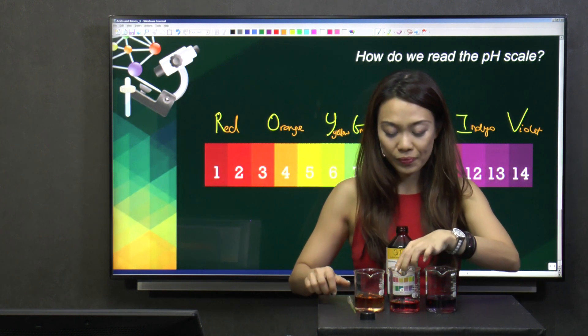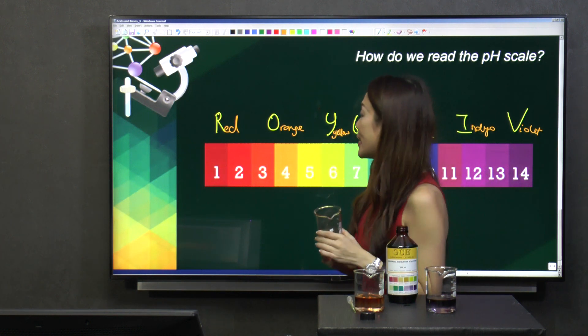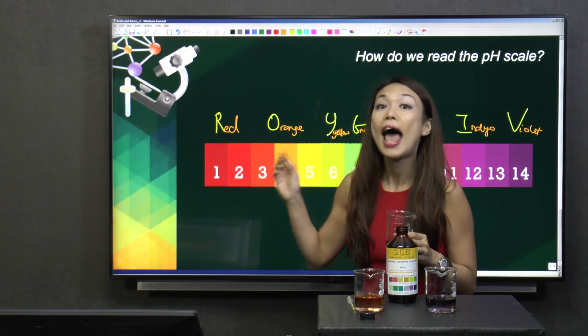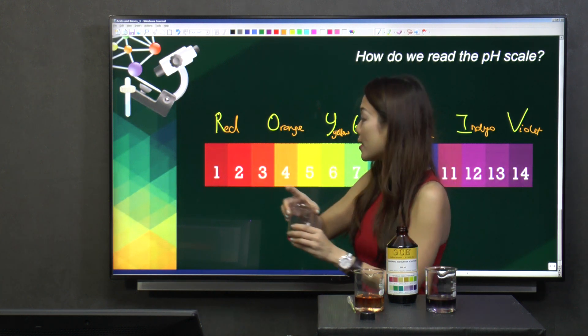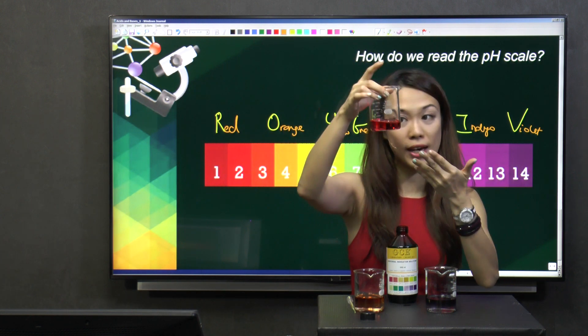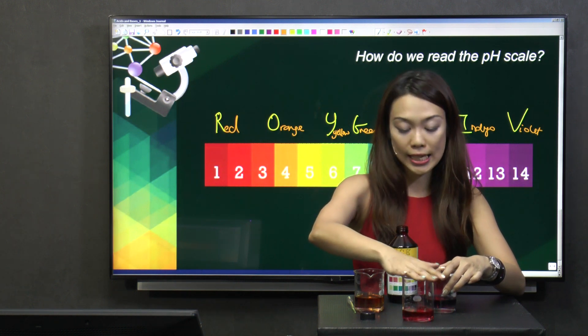Now, first of all, this is red in colour. So, using the universal indicator, what do you think this is? This is an acidic solution. Can you see the red? Wow. I hope the video captures this nicely, because from here, it looks really nice. And, this is red. Of course, it's acidic.